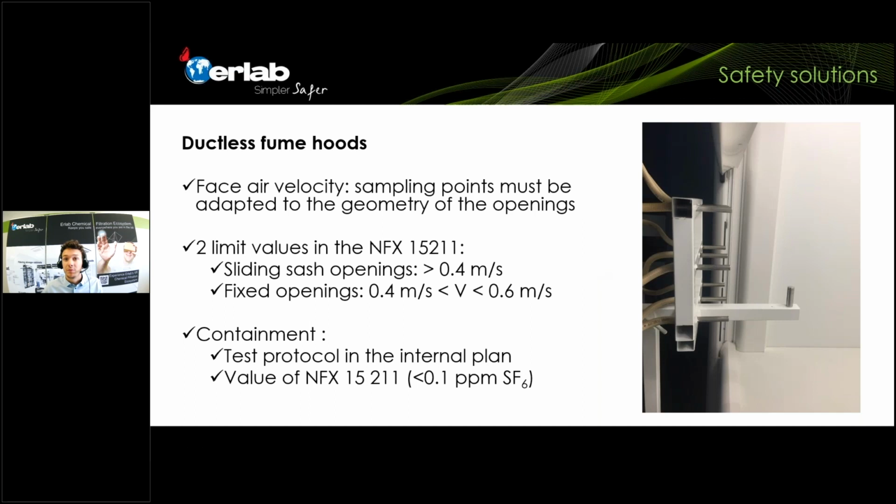Again, if we talk about containment, because that's what this is all about, it's about minimizing the risk. So this air barrier that you have between the chemical products and the person in the lab must be tested as well on a ductless fume hood. So how do we do that? We apply exactly the same protocol that is performed on a ducted fume hood, which is part 3 of the EN 14175. So what do we do in a ductless fume hood? We are going to test again with SF6 and see if there is less than 0.1 ppm of that chemical released in front of the user.